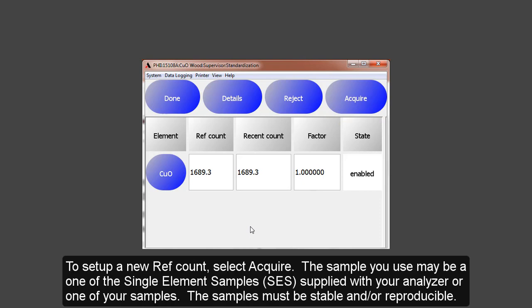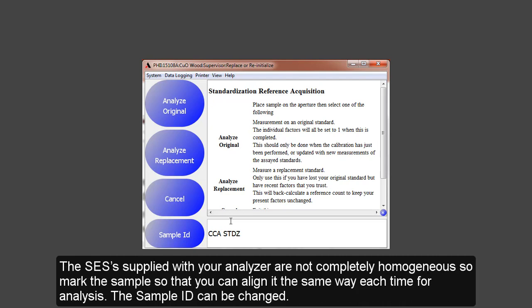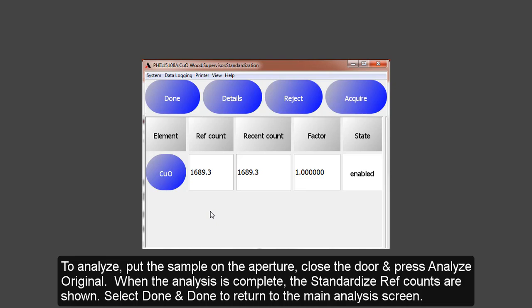To set up a new reference count, select Acquire. The sample you use may be one of the single element samples supplied with your analyzer or one of your samples. The sample must be stable and reproducible. The SESs supplied with your analyzer are not completely homogeneous, so mark the sample so that you can align it the same way each time for analysis. The sample ID can be changed. To analyze the sample, put the sample on the aperture, close the door, and press Analyze Original. When the analysis is complete, the reference values will be seen on the screen. Select Done and Done to return to the main analysis screen.